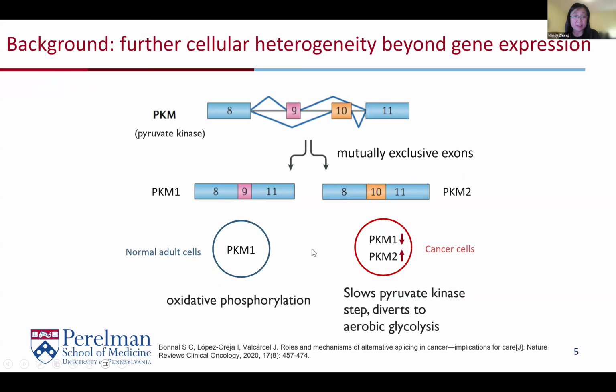So even more, this is, I think, common knowledge in this group, that differential splicing has high importance when we want to distinguish certain disease cells. For example, here's cancer, a differential splicing event that happens in cancer. This PKM gene, which is part of the oxidative phosphorylation pathway, is a pyruvate kinase.